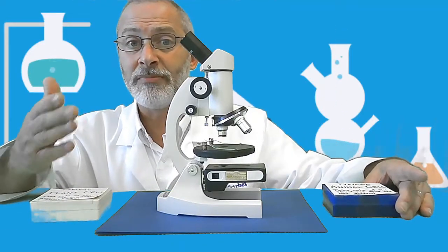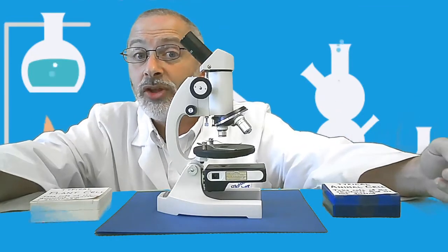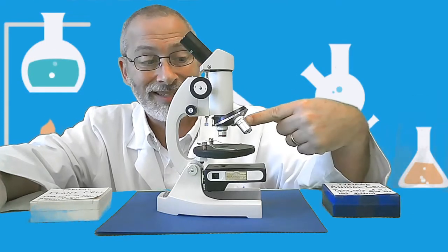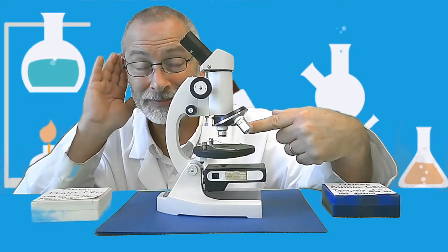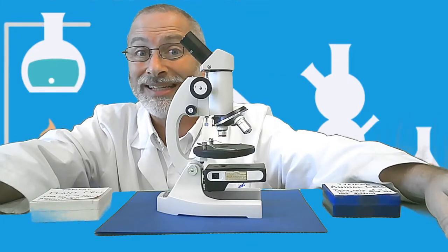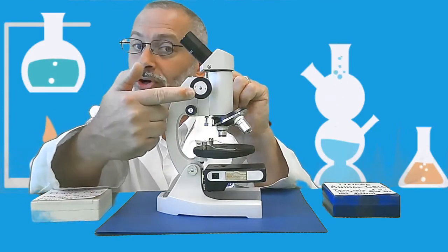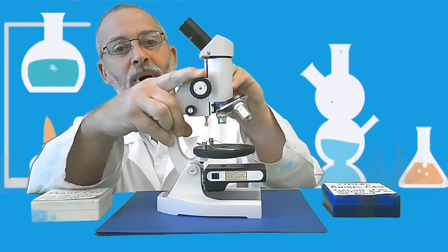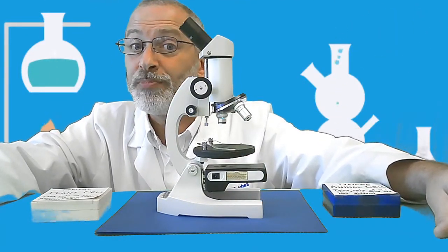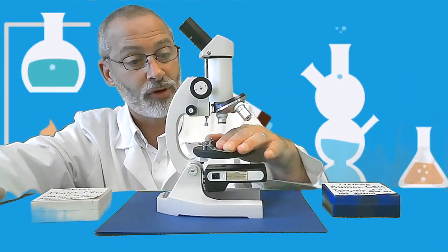Now, once you've obtained the microscope, I want you to remember some things when beginning the use of your microscope. Which objective lens should we all have pointing down? The low power objective lens is always pointing down, and hopefully you remember why. Next, we use the coarse adjustment knob to raise the body tube all the way, and then we're ready to place our specimen found on our slide on the stage for us to observe.